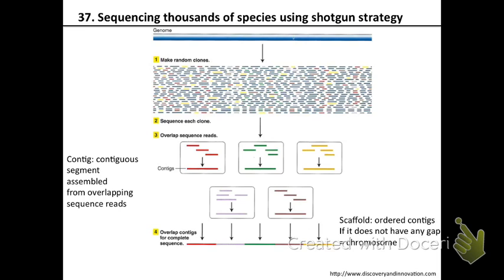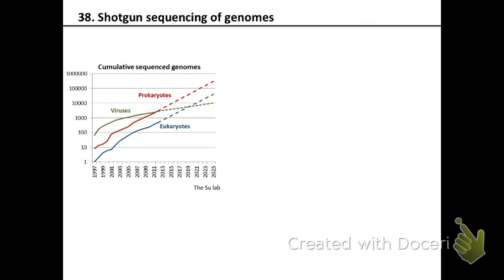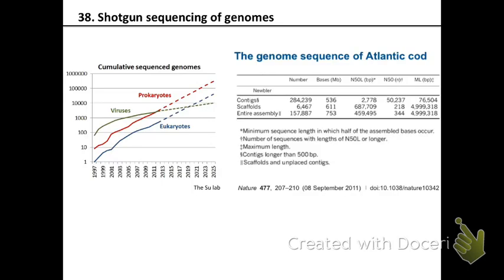Does that make sense? And so whenever you hear in the news that the new genome sequence of this blah blah was sequenced by high throughput sequencing, this is probably what they've done. A lot of organisms and crops of economic importance are sequenced this way, so that we can actually know the DNA sequences. All right, and the sequencing technology allows us to sequence more and more organisms, so we're not only sequencing humans, we're sequencing viruses and prokaryotes and eukaryotes, and so the number of genome sequences in the public databases is increasing with time, right? All right, so here's, for example, one organism that was sequenced. It's Atlantic cod, right?